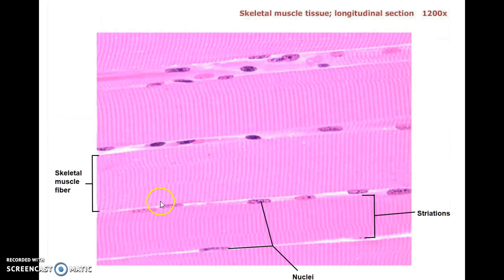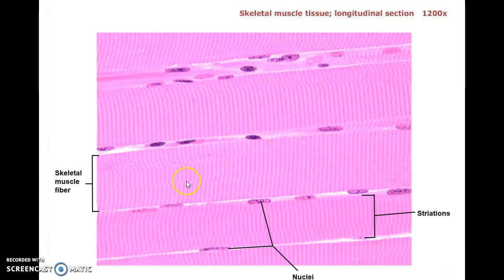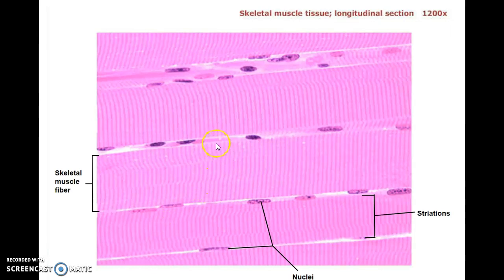In the next slide, you see skeletal muscle at even higher power now, with the cells running horizontally across the slide. You can also see the multiple nuclei on the surface and those beautiful striations, which represent, remember, the actin and myosin proteins all lined up. The proteins run lengthwise along the length of the muscle cell.